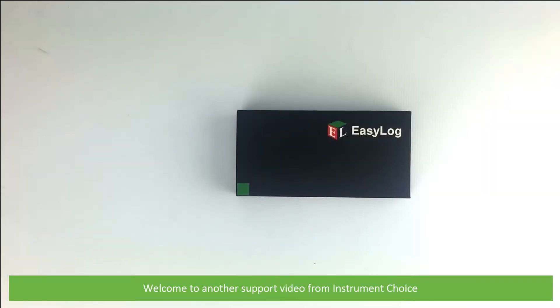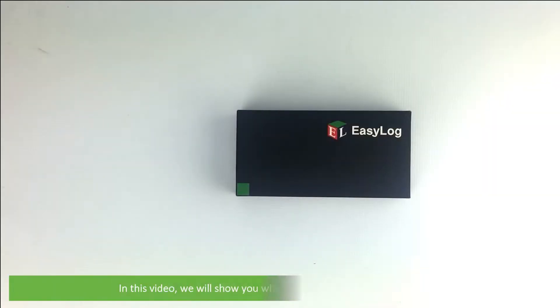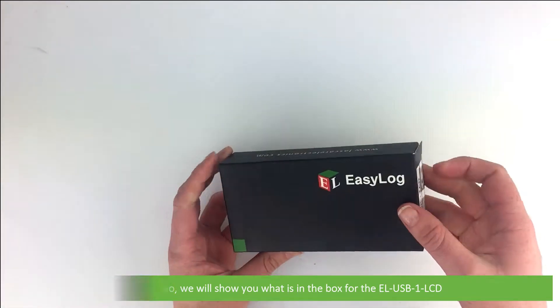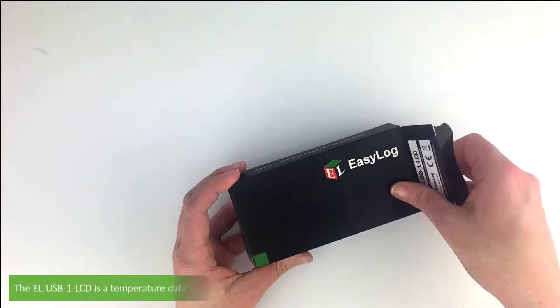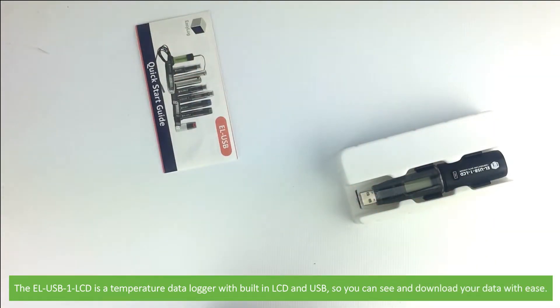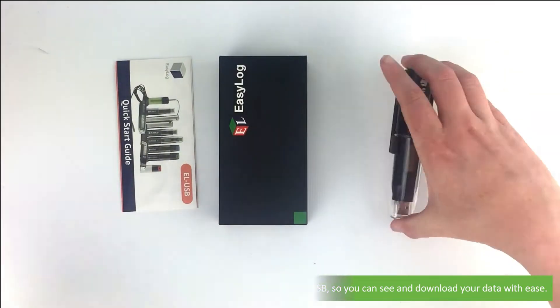Hi and welcome to another support video from Instrument Choice. In this video we will show you what is in the box for the EL-USB1 LCD. The EL-USB1 LCD is a temperature data logger with built-in LCD and USB so you can see and download your data with ease.